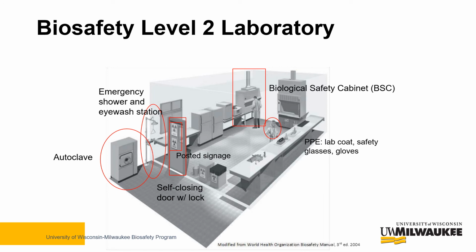The appropriate PPE is worn, including a lab coat, safety glasses, and gloves at all times. A sink for washing hands is available near the exit. There are non-porous work surfaces, and the windows are sealed.